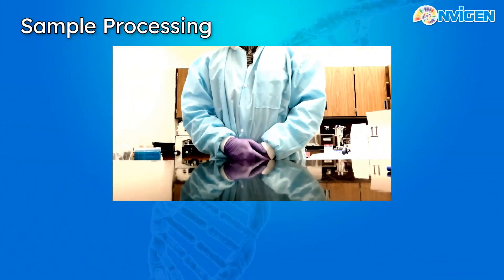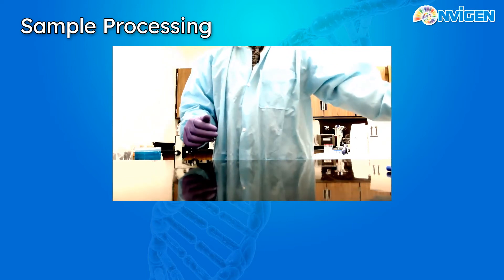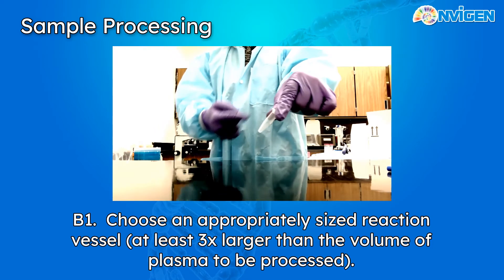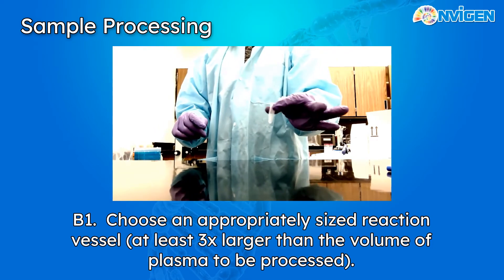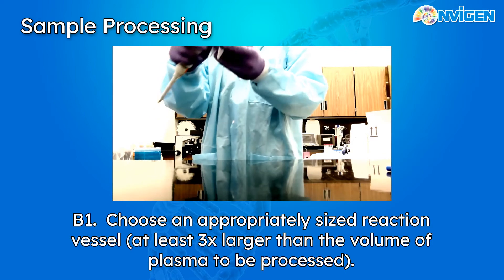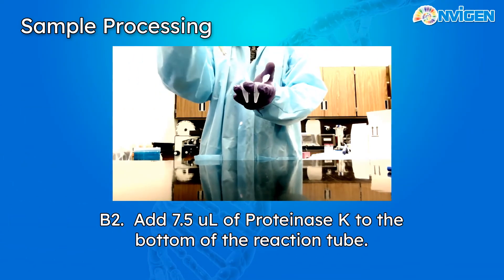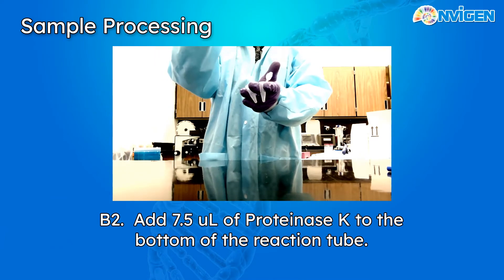With reagent prep finished, let's start processing our samples. The first thing we need to do is choose the appropriately sized vessel for the amount of sample you wish to process. A rule of thumb is to use a tube that's 3 times larger than the amount of plasma you'll be using. Since this demo will be showing how to process 500 microliters of plasma, a standard 1.5 mL Eppendorf tube is more than enough. Add 7.5 microliters of Proteinase-K to the bottom of the tube.